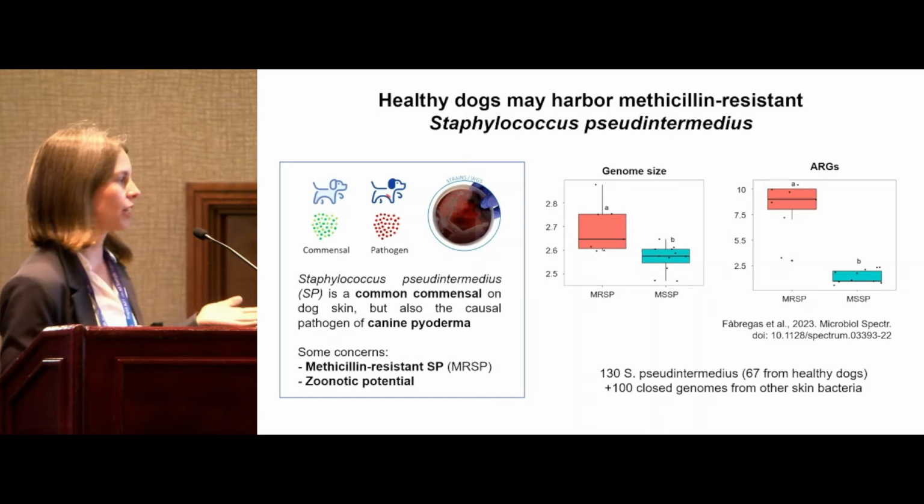These are the total number of MAGs. When we dereplicate at the species level, we got 320 species-level MAGs. 80% of these were high quality and 20% were medium quality. And from the high quality, about half of them were single contig and the other half were several contigs, but still only 4 contigs per MAG. So very, very contiguous assemblies. Another thing that we checked is that we mapped the raw reads back to our species-level collection, and we saw that almost 90% of the raw reads were mapping back to the MAGs, which is great. I mean, we are capturing the whole metagenome in MAGs.